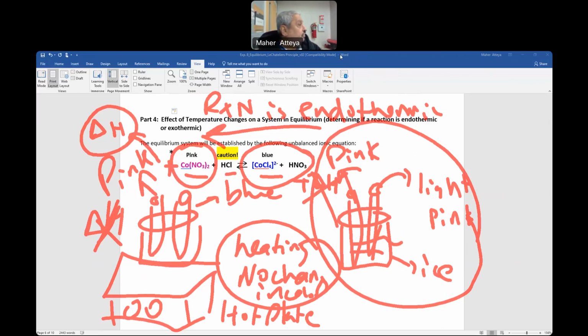I will just suspend for you the HCl concentrate, the 12 molar. It's very concentrated and it's very dangerous. And I would like to have everyone with goggles, please. Everyone with goggles. We are dealing with very concentrated acids and bases, because even 6 molar is half of the higher concentration. So I'll stop recording now and let's start the experiment. Thank you very much.